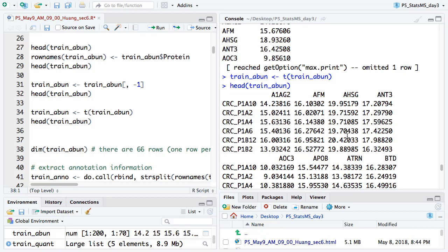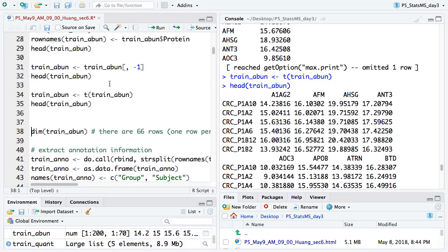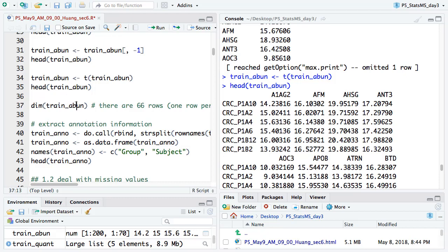The T function here transposes the data matrix, so now the column becomes the row and the row becomes the column. Now the columns are proteins and the rows are subjects. Most R packages for classification, clustering, or PCA will want this format as input — columns are different genes or proteins, rows are different subjects or samples. That's the standard format when you use R packages.